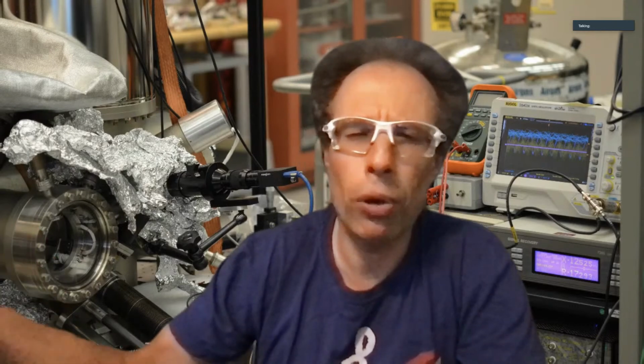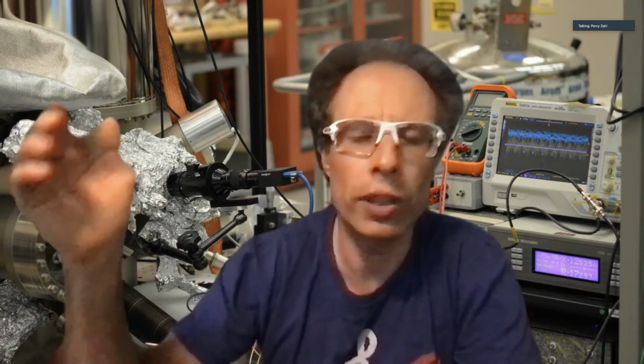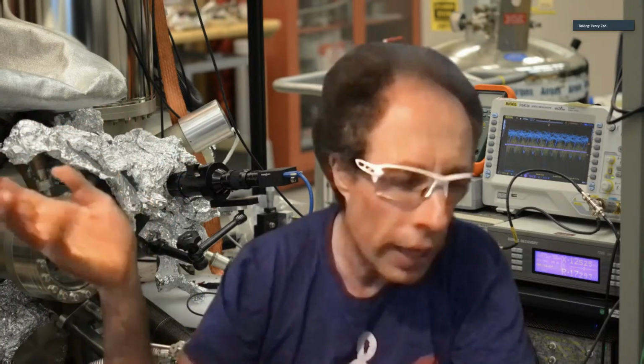Awesome. Thank you, Percy. Are you working on any further upgrades to this microscope, currently or in the future? Yeah, I'm constantly developing that machine, optimizing something on various ends. I'm exploring new sample preparation methods, new ways to put molecules on the surface beyond the simple flash method I'm doing right now, actually.